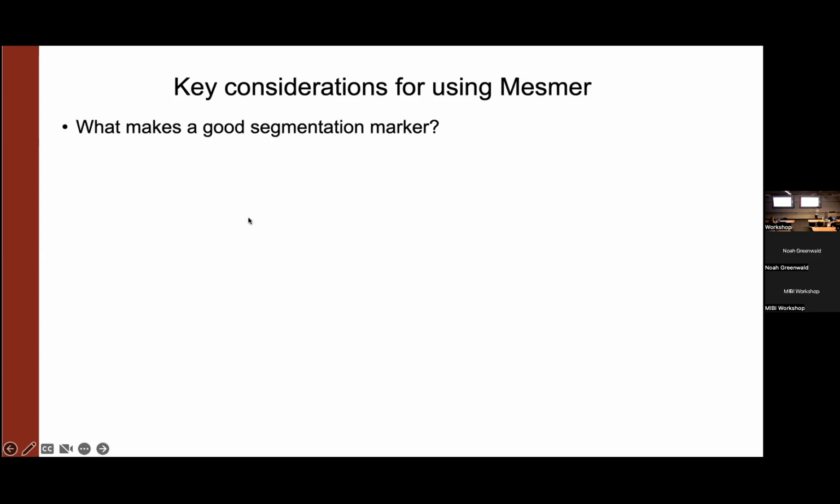In general, if a cell does not have a membrane marker included, Mesmer will not know what the shape of the cell is. And so if you want it to segment the cell rather than just the nucleus, you have to give it a membrane or cytoplasm marker. Otherwise, it is literally impossible for it to know what the shape of the cell is. You might have a mix of immune cells and tumor cells and endothelial cells. And so far, we have yet to find the one marker to rule them all that will give you the shape of every single cell.